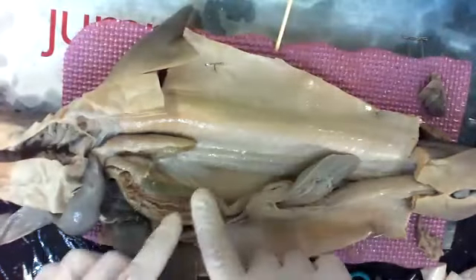It's hard for us to keep water in. You don't feel like that because your body's so good at doing it. But it pulls the water out of the feces until it's the poo that we think about going into the toilet. If you compare, there's the esophagus, stomach.